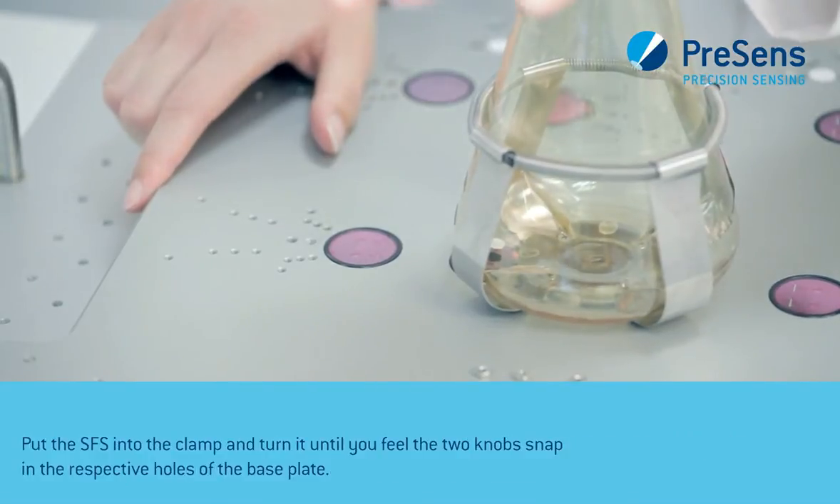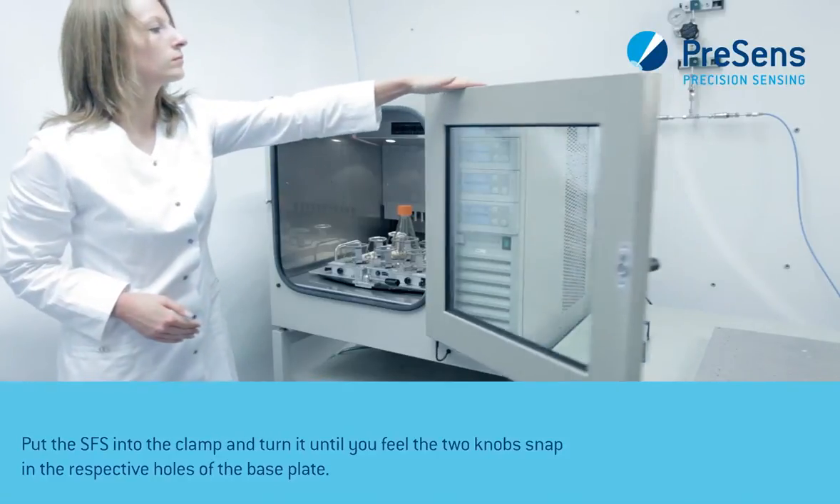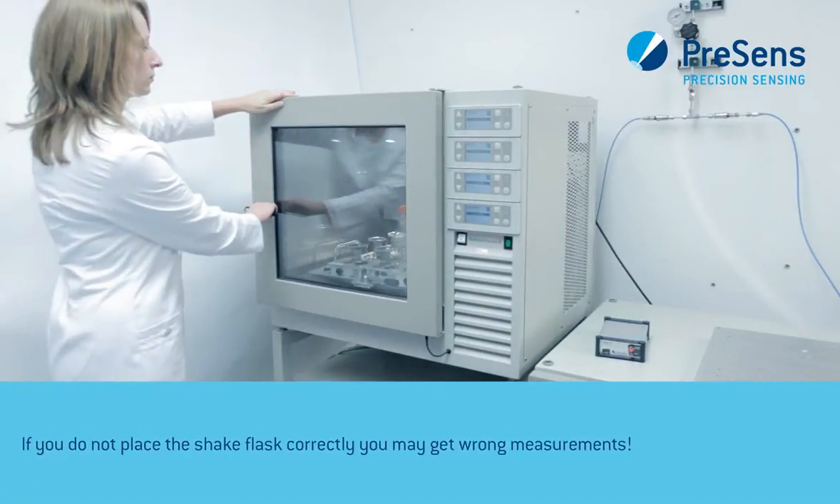Put the SFR into the clamp and turn it until you feel the two knobs snap into the respective holes of the base plate. If you do not place the shake flask correctly, you may get wrong measurements.